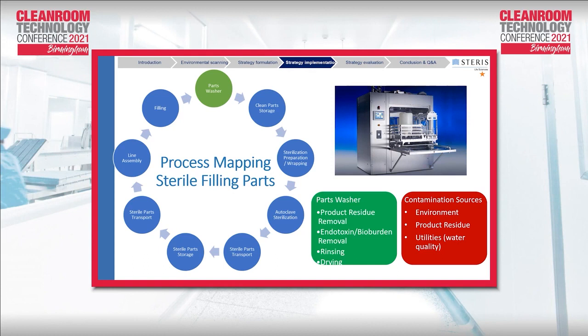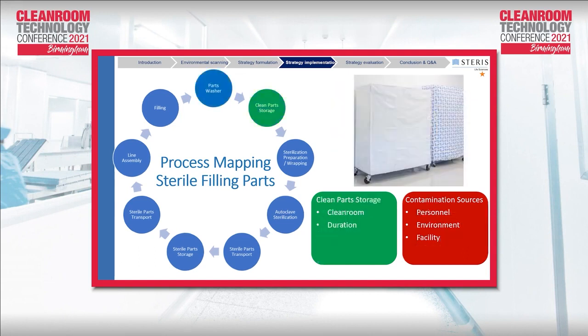So as a part of the washer, the goal of this washer is to be able to remove product residue if it is a reused product. Remove, of course, endotoxin and bioburden to a certain level based on the rinse quality. The source of contamination may come from the environment or product residue or even the utility where you have microorganisms.